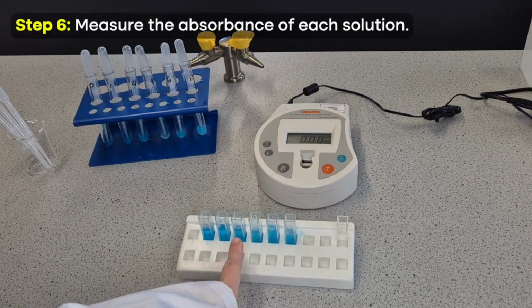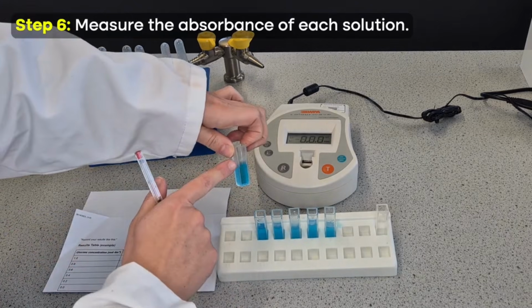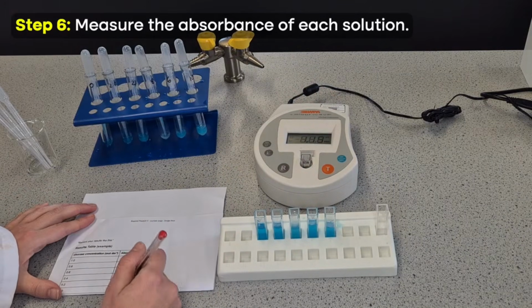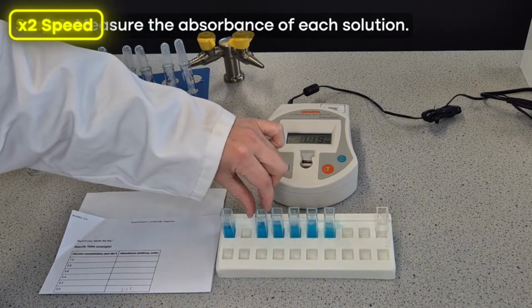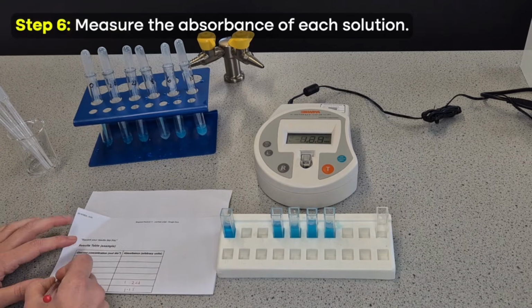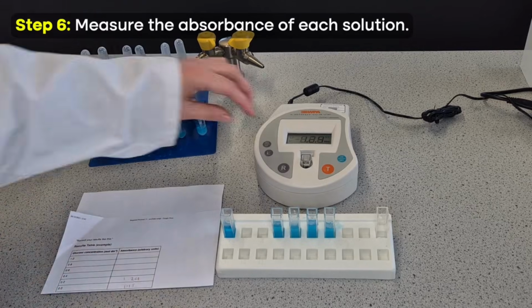So now we're ready to test the absorbance of each of these samples. And I've got my table to record the results as I go, making sure I'm holding on the ridge side and frosted triangles at the front. When I push, make sure it does click, and we press T for test. So that was my 0, so 1.15. And then my 0.2. I've actually got slightly different concentrations to these, but I think it's because I've said millimole here, so yeah, that's fine.